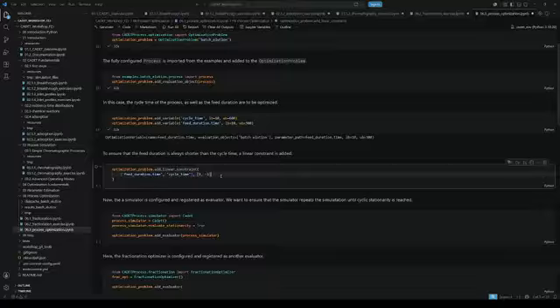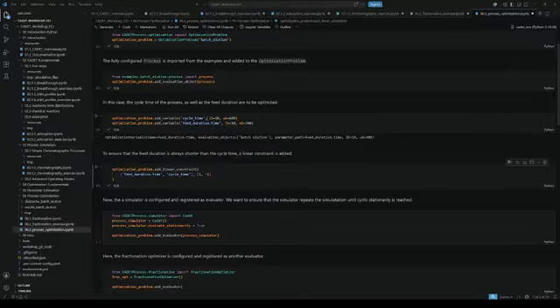And we add some constraint on how the relationship of both of them is going to be, right? We don't want the feed duration time to be longer than the full cycle time because then there's no more elution time.